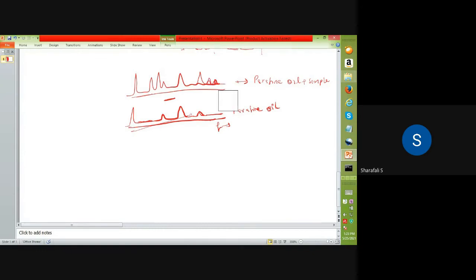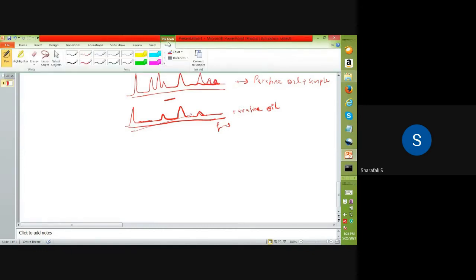We usually do that in centimeter inverse, so in all figures you plot that. Okay, that is also possible. So anyway, this has to be subtracted.